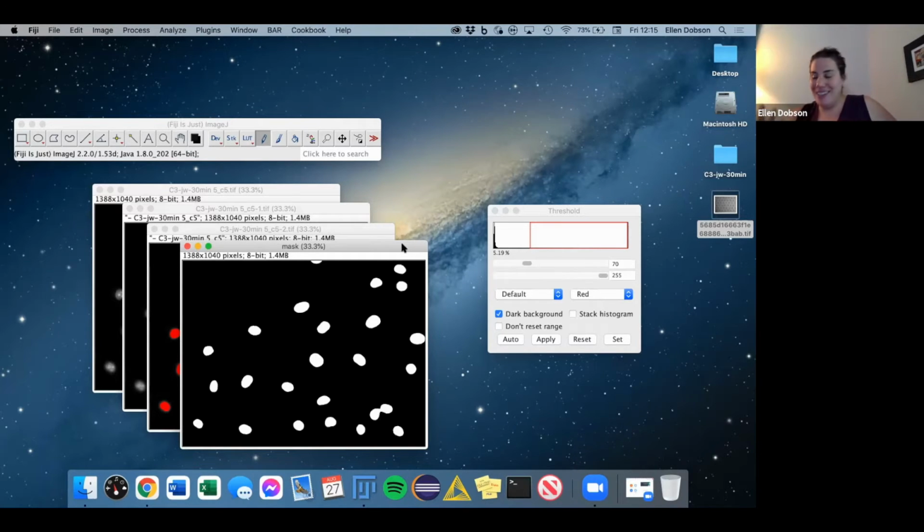Technically, what it does is it finds the Euclidean distance map and then finds the ultimate eroded points. It then dilates those ultimate eroded points, which are basically the peaks, or local maxima, of the Euclidean distance map. And it dilates them as far as possible until you hit the edge of the object, or the edge touches another, adjacent growing region. So then it basically creates a single pixel cut. It works best for smooth convex objects that don't overlap too much, so more circular kinds of objects.